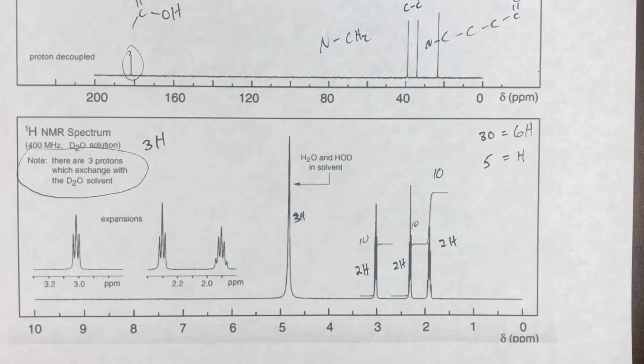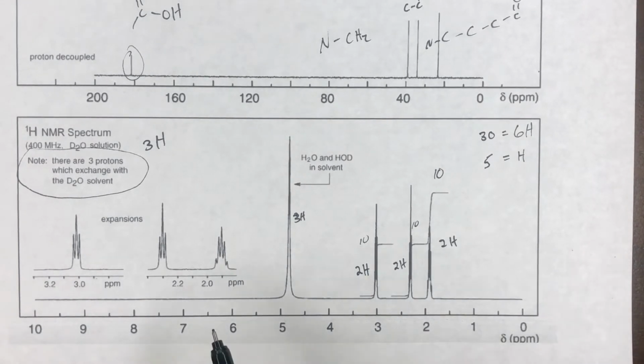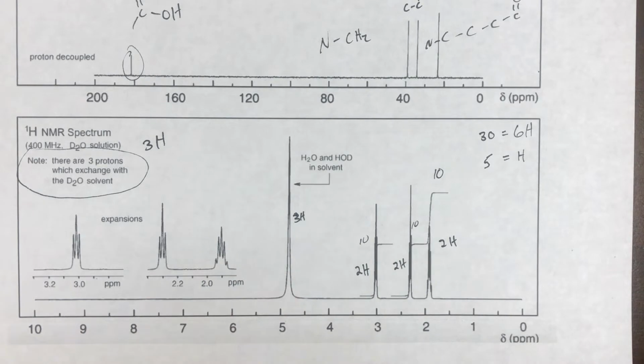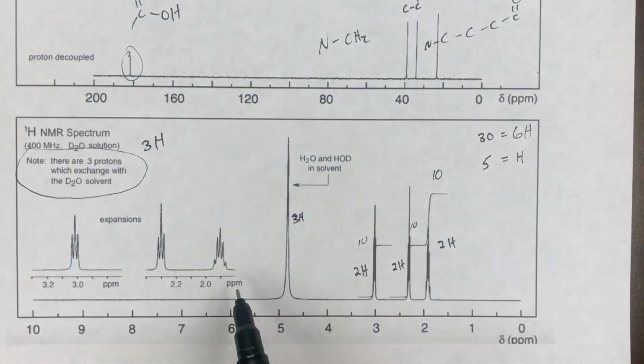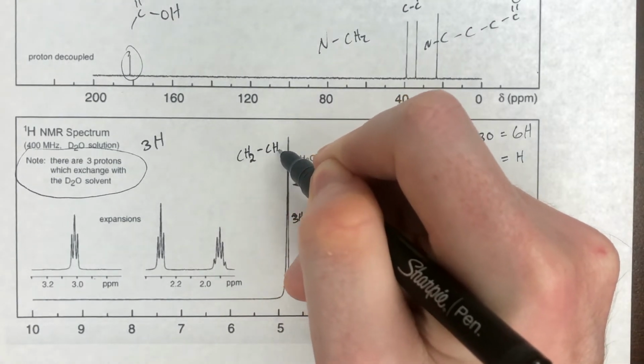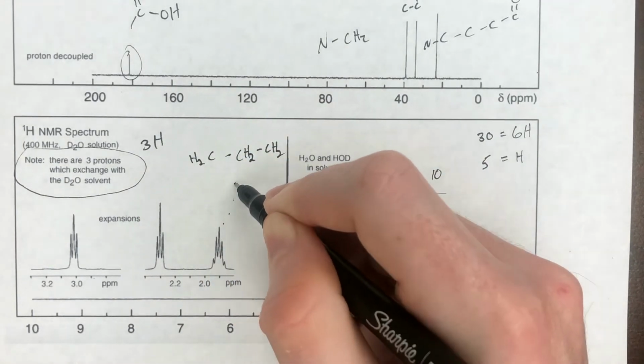Okay, so now let's see if what we thought from the carbon NMR is matching the proton splitting. So we see 3 unique CH2s, so again, supports there's no symmetry. We see that the furthest upfield, or the lowest number of CH2 here, is split by 4 neighbors. So that CH2 must be sandwiched between 2 other CH2s. Right, so this peak is that one.